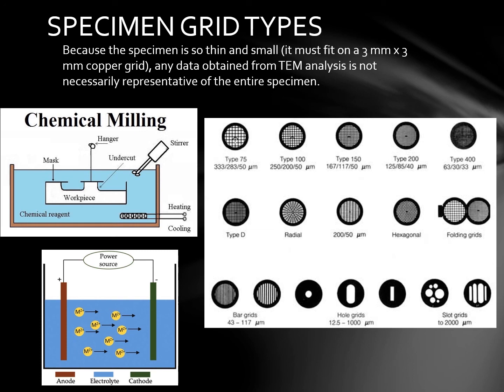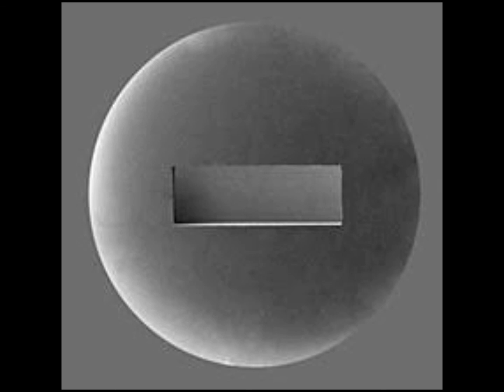For example, for nanotechnology and molecular biology research, you get silicon nitride thin film windows. So for example, a cell can be grown on the film in its environment and then subsequently analyzed. It's also useful for polymer research such as nanoparticles, thin films, and material science research.